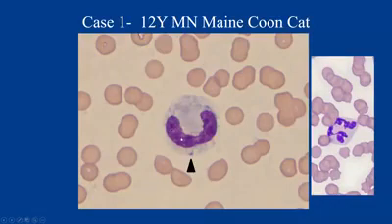We've got this band-shaped nucleus, so we've got a band here, we've got cytoplasmic basophilia here and foaminess. And then we're also pointing out some of these irregular aggregates of blue-gray material, and these are Döhle bodies, all right? Döhle bodies are another criteria of toxic change in patients.